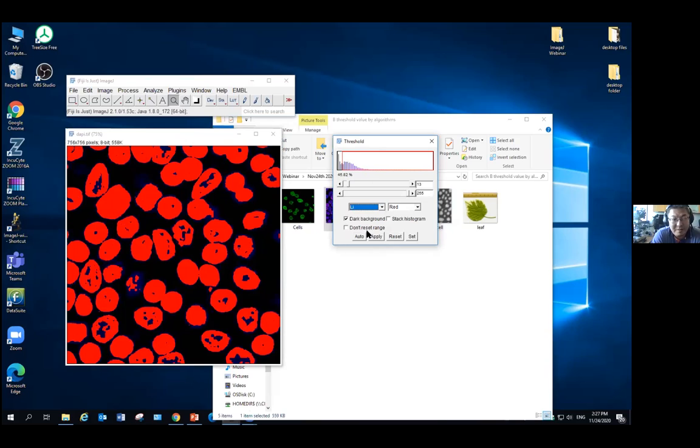Once you have your image, when you do the image analysis, I would say the first thing is you just open some typical images and play around like this. You need to know your image, to understand your image. Then you begin to have an idea how to separate your image signal and the background. You get a feeling for the character of your image. Then you find a way, using intensity values or some other method, to separate the pixels in the signal region, your object, from the background. Then you can do the thresholding to put them into two groups.